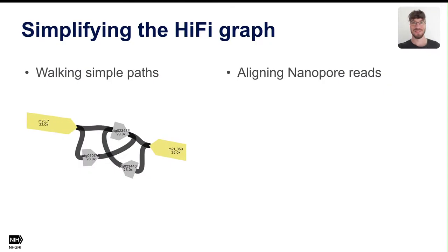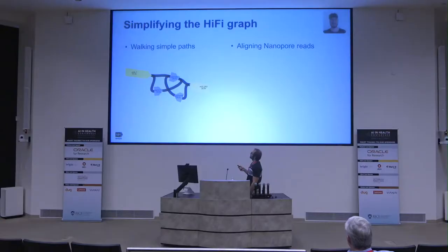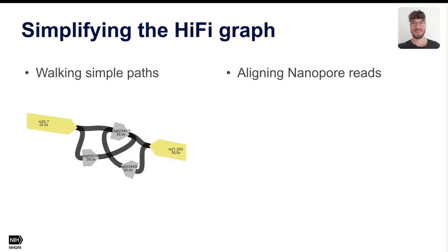So this is an assembly graph. If you're not familiar, there is a sequence on the nodes here. These edges indicate that there's similarity, so this is saying that the end of this node sequence shares some similarity with the beginning of this node. And the numbers here indicate coverage. So if you look at this as a human, the coverages are all at normal, about 25, 20 coverage, which is what we expect. That's what we sequenced this genome to. And so none of these look like noise.